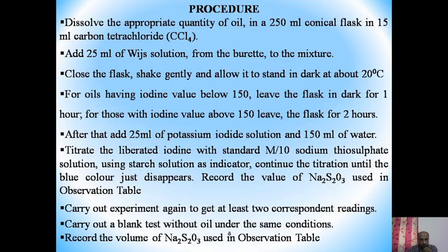Then we have to titrate the whole solution, with the liberated iodine, against standard sodium thiosulfate solution using starch solution as an indicator. Continue the titration until the blue color just disappears. Record the volume of sodium thiosulfate used in the observation table.